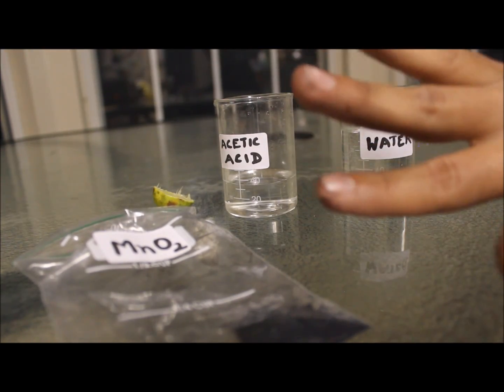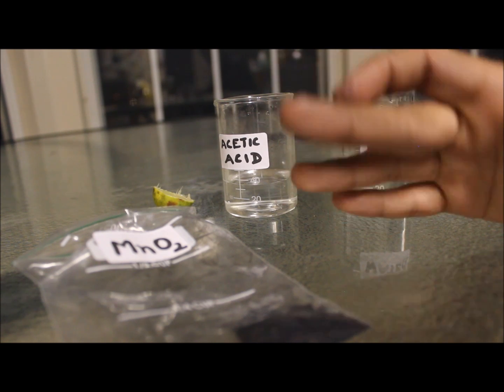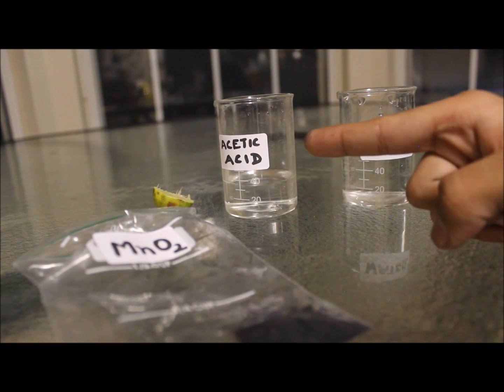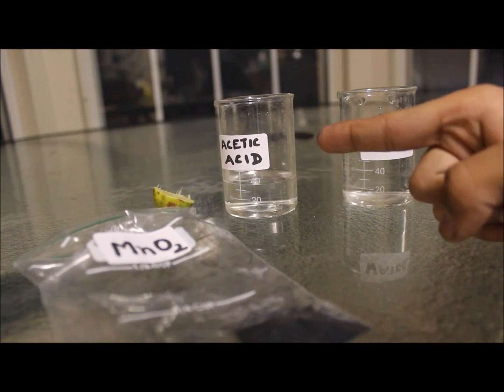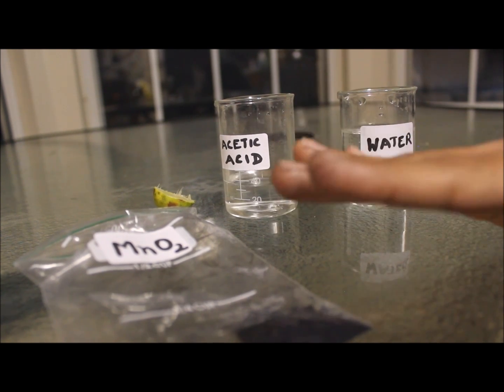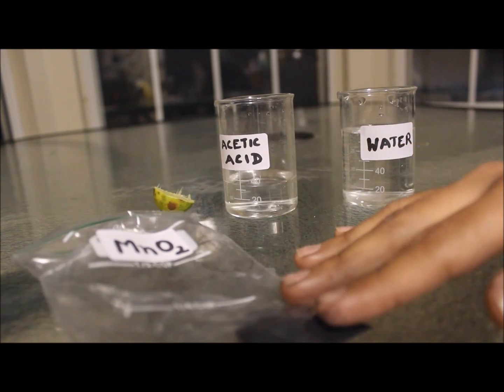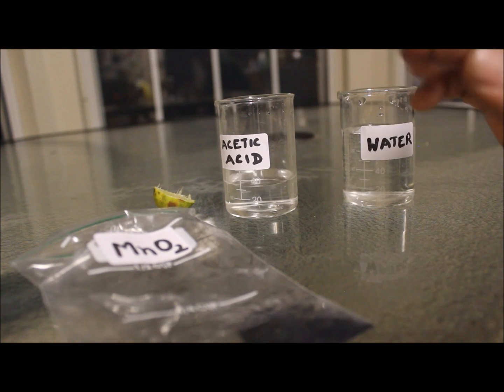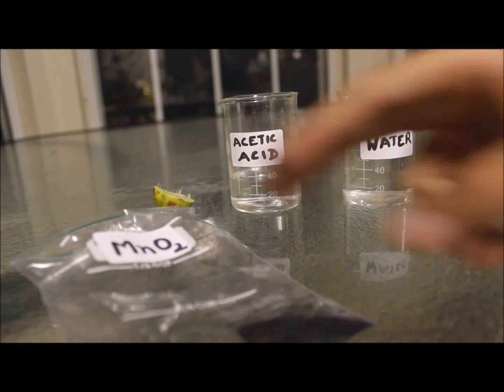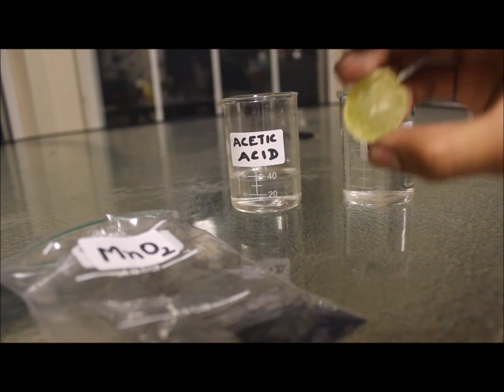Nearly my hands are clean — just some more acetic acid and all of it goes away. But I really don't like this method of using acetic acid to clean this off, because acetic acid really stinks and the smell is difficult to get rid of.